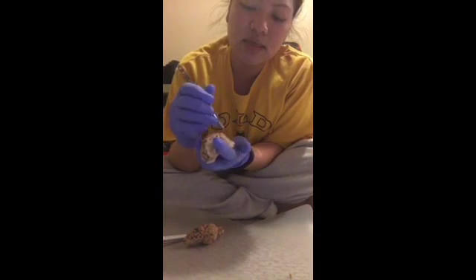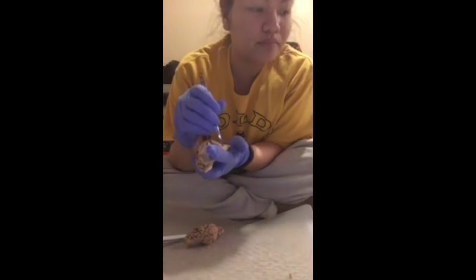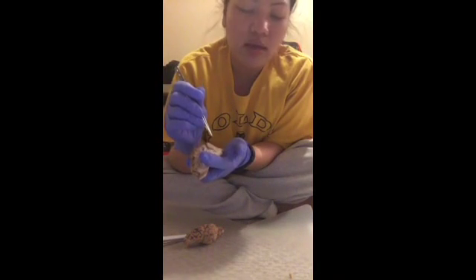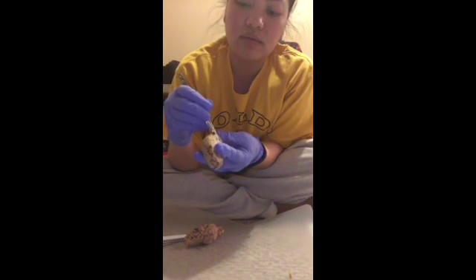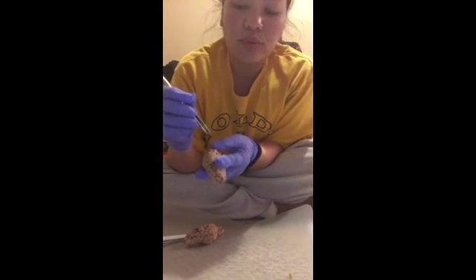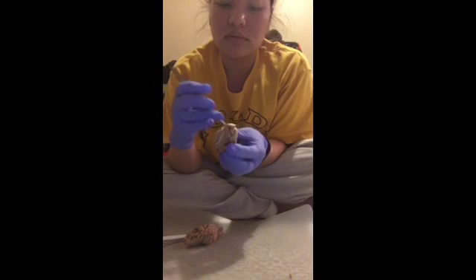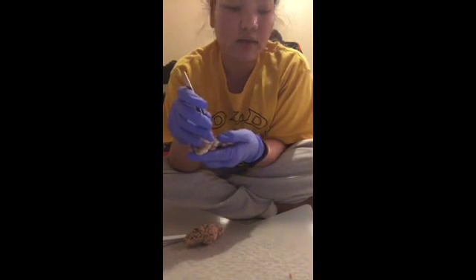And the pons is this one. The pons is right here. The medulla is this one. It's right here. The fourth ventricle is located somewhere in here. It's the fourth ventricle, right around here. Then the corpora quadrigemina is right here. It's hard to see because this is off, but it's right here.